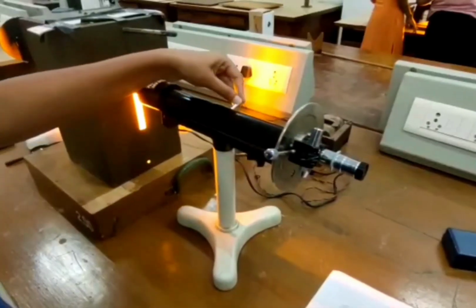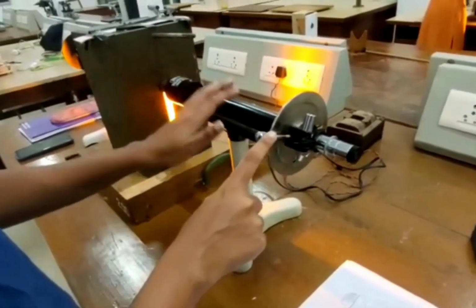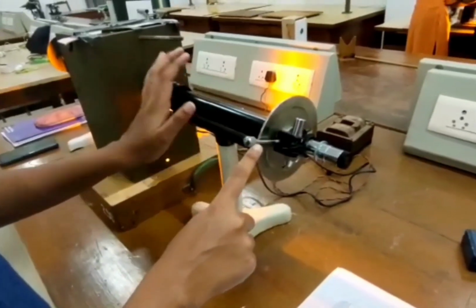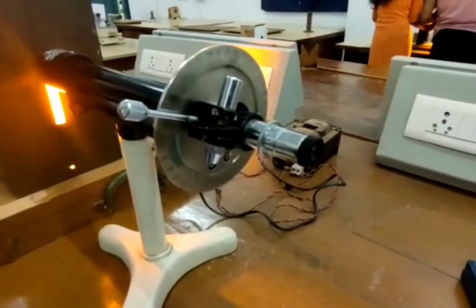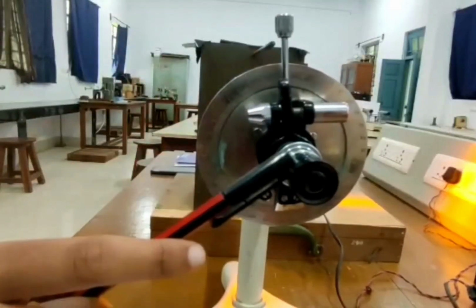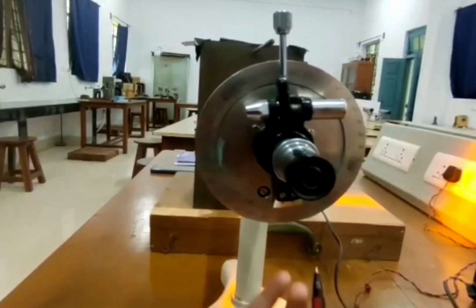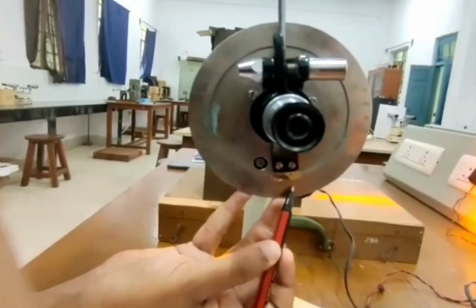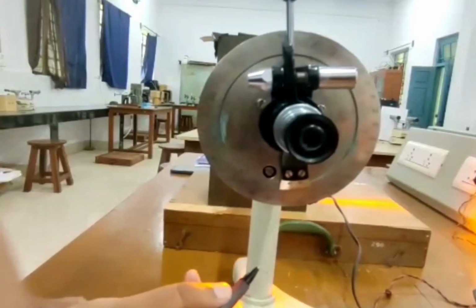Like we observed the R0 value for distilled water, the same we are going to do for the sugar solution. The full shade has been observed for 0.4 gram per centimeter cube sugar solution, and the main scale reading is 167 and the vernier scale division is 2.